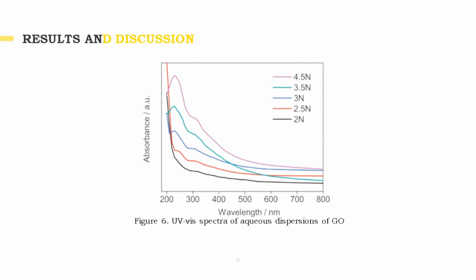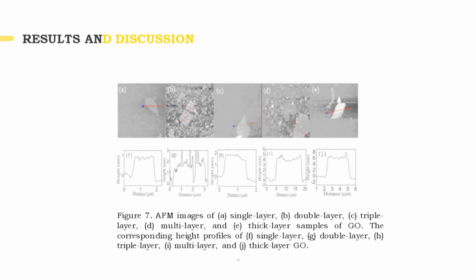To identify why the spectra of the graphene oxide samples were different, AFM measurements were obtained to determine the number of layers each graphene oxide sample possessed. AFM observations have shown that the thickness of chemically derived single, double, and triple layer graphene sheets are approximately 0.57, 1.25, and 1.83 nanometers. And here, the interlayer spacing is calculated to be in the range of 0.6 to 0.7 nanometer. The distributions derived from AFM measurements show that the graphene oxide is composed of a single layer.